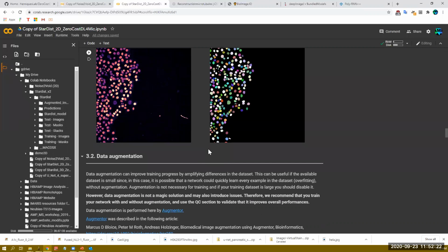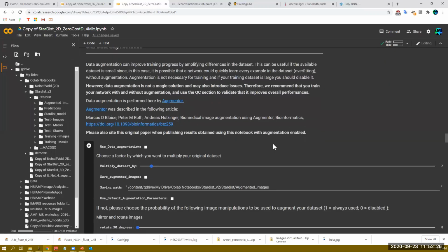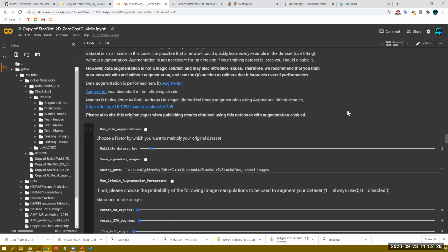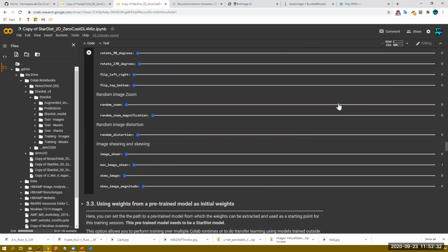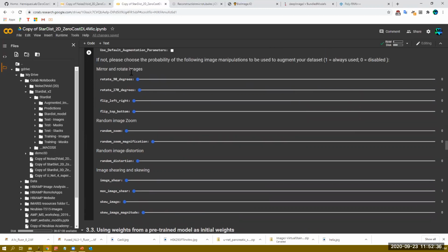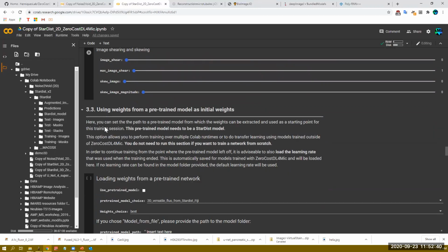to make sure that the model knows what it needs, basically. The data augmentation step I did mention to make your model more robust. I didn't do this because when I tried it, it broke. So maybe I did something wrong. I'm not sure, but you can see all the different transformations you could do to make sure that your model is pretty robust.